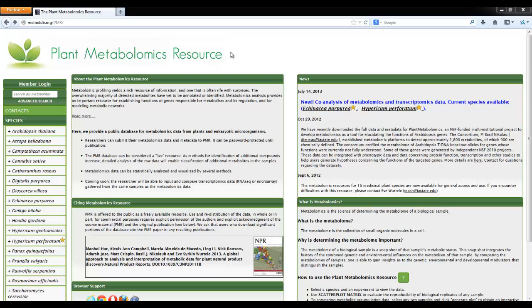The purpose of this video is to give a quick introduction to the Plant Metabolomics Resource website, as well as give a brief example of how to access some of the data that is available.